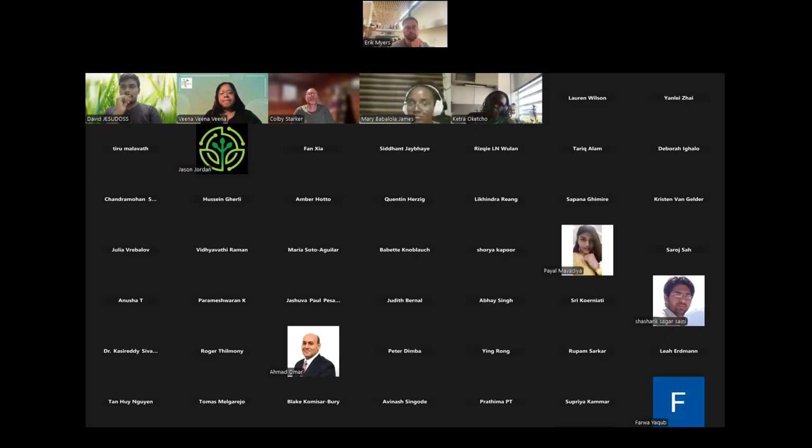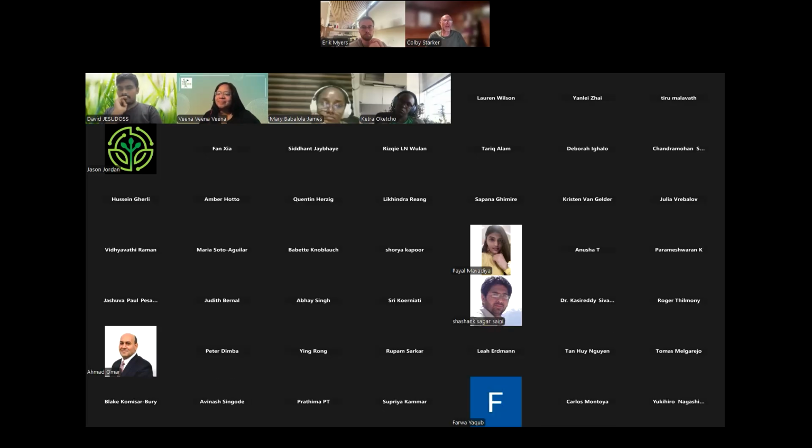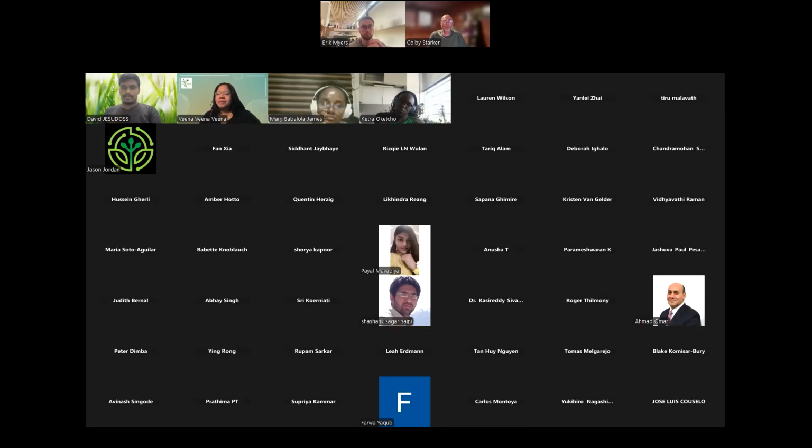Yeah, I can attempt to answer that one. We have worked in a few species that have reasonably redundant genomes. The most experience that I've had is actually working in wheat, and it was pretty painful to assay. Designing the guides was actually not terribly hard. You line up all the homologs, and you pick sequences that target either all the homologs that you want or only one of the homologs.